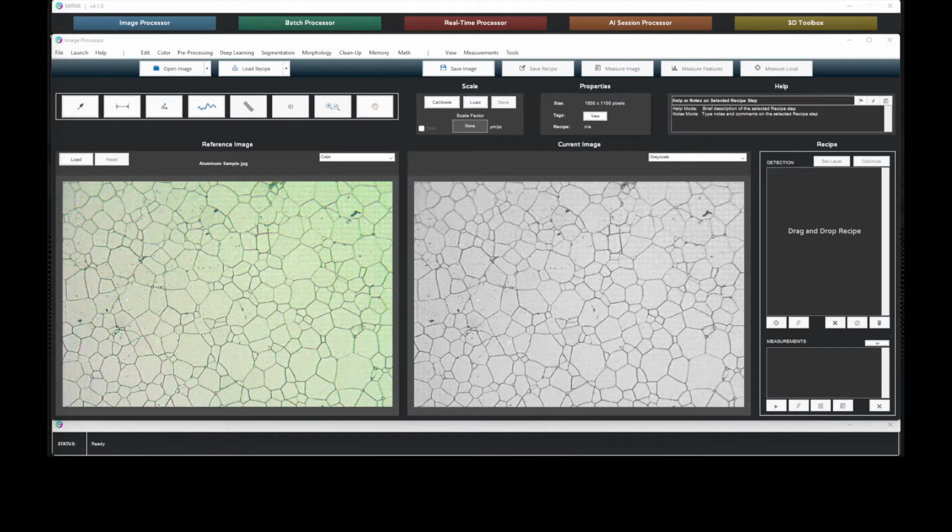When performing characterization of aluminum alloy samples imaged using an optical microscope, the variable grain boundary contrast, background artifacts, and uneven illumination present a significant challenge, especially under standard operating conditions with operator variation in sample preparation and imaging setup. In the past, grain size information has been obtained using techniques like manual intercepts measurement.